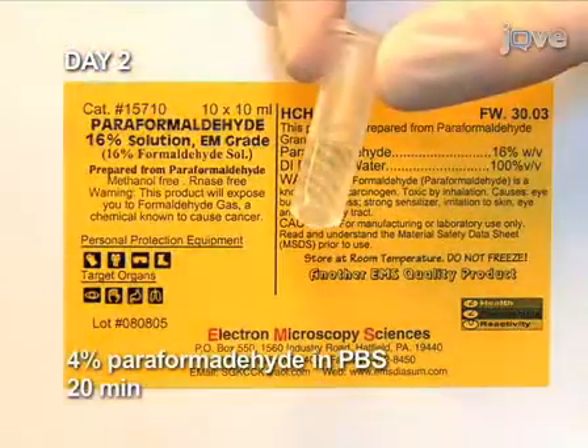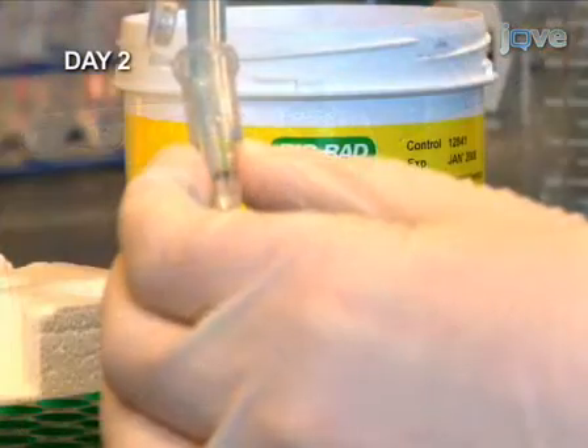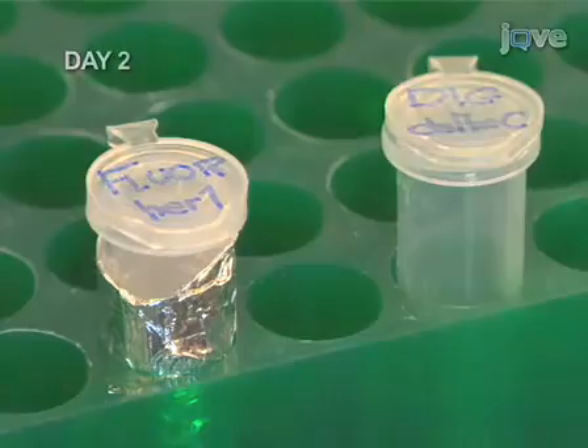Fix the embryos in paraformaldehyde. Finally, wash the embryos twice in PBST for 5 minutes. The embryos are now ready for hybridization with the RNA probes.